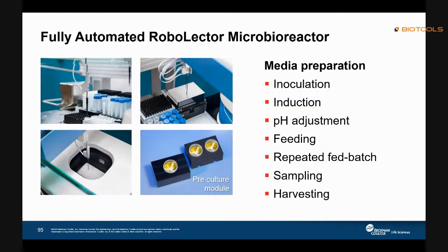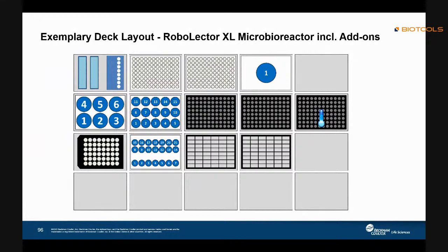If we stop the shaking, the oxygen transfer rate will be different, and we do not know what will happen to your cultivation. Maybe it is a positive effect, or maybe a negative effect. We do not know. So that is why in the whole process, we do not stop the shaking. This is to make sure that everything will be good enough for your cultivation.